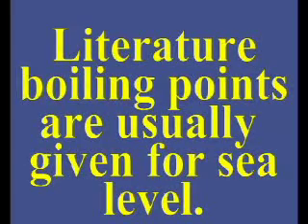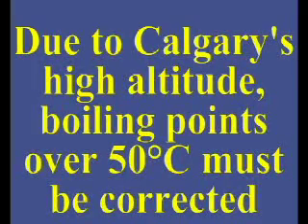Literature boiling points are usually given for sea level. Due to the high altitude of Calgary, the average atmospheric pressure is much lower than that at sea level. This necessitates correction for boiling points greater than 50 degrees Celsius.